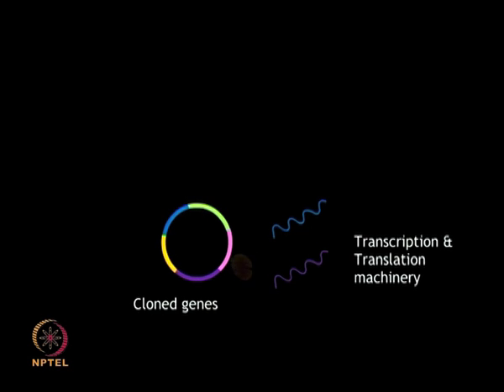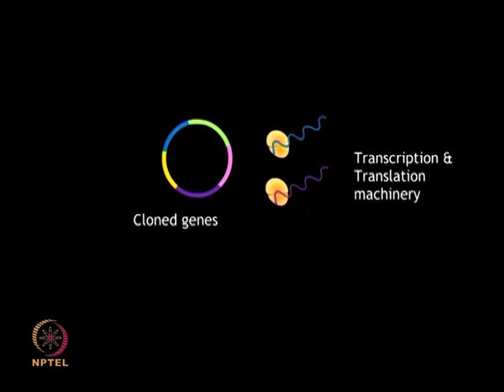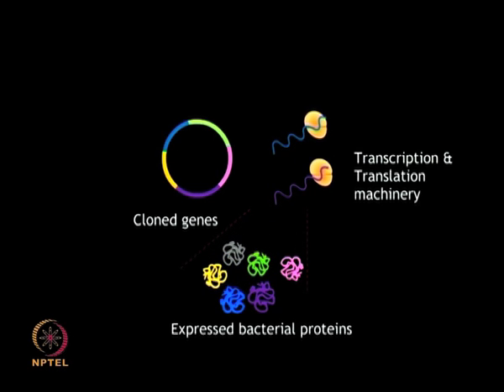These clones were grown overnight at 37 degrees centigrade in the antibiotic containing medium, after which the protein expression was induced by addition of IPTG. The cells were harvested 4 hours after induction and then protein was purified.